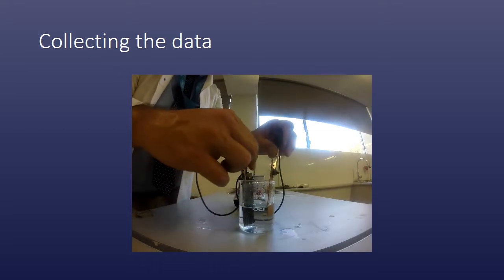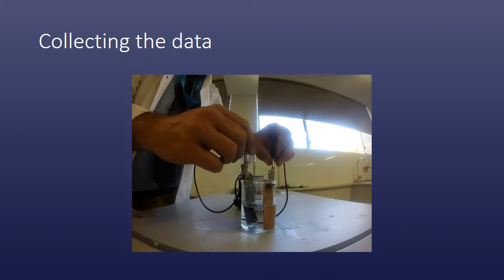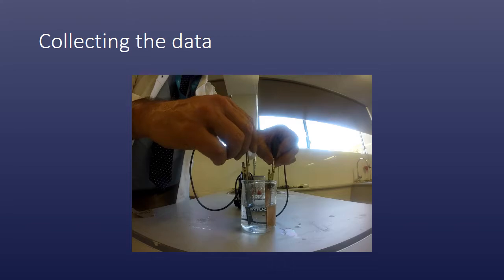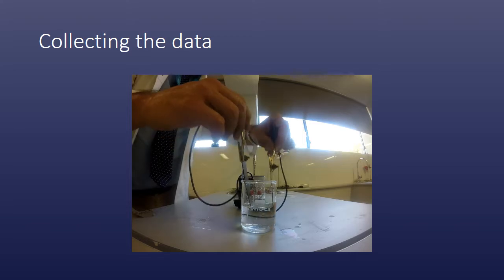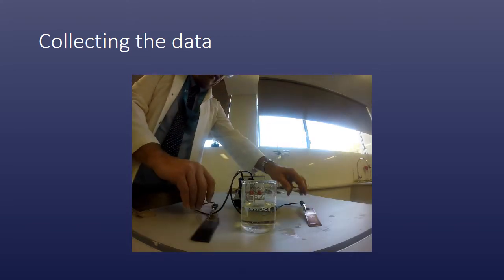And this is because I haven't changed either of the two electrodes, but the electrolyte now is much more effective. The sodium chloride in there is conducting the ions between the two electrodes, closing that circuit much more effectively. And so now I have a much more efficient circuit, and it's giving me a much better reading.